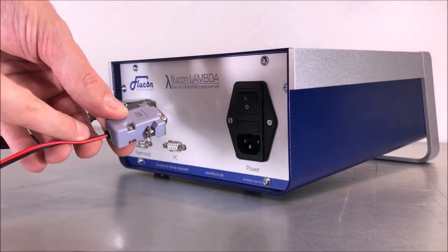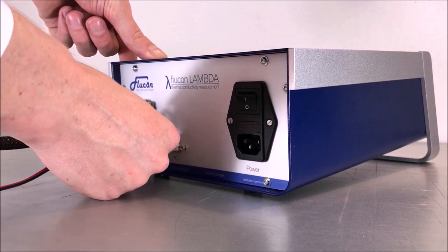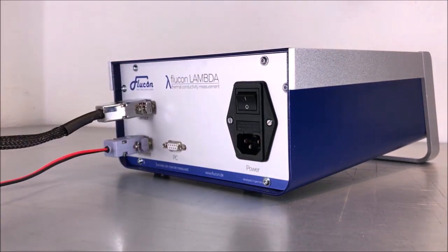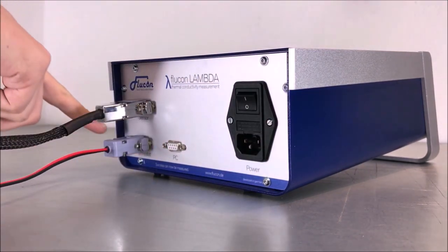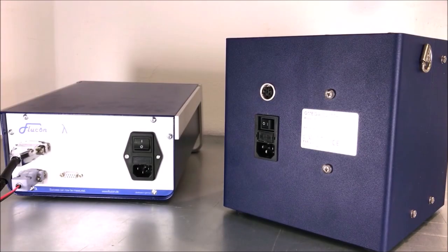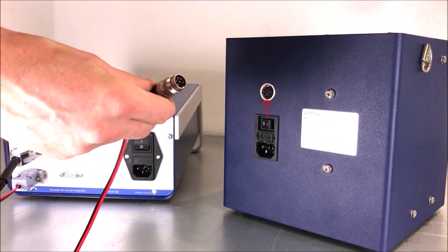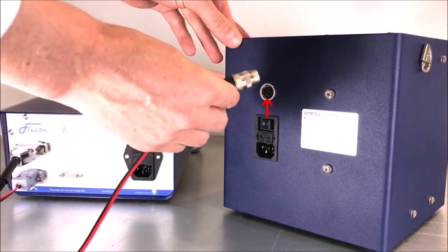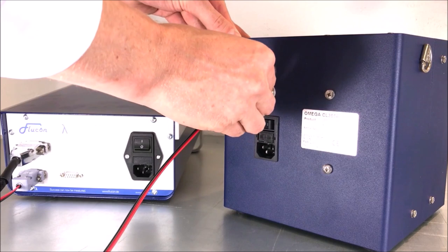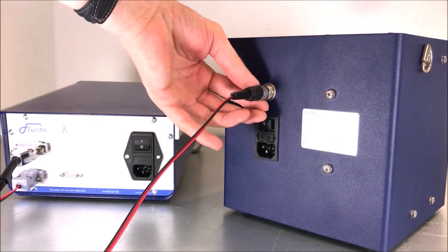After this, connect the sub-D ending of the thermostat cable to the thermostat socket. Again, use the screws on both sides to fix the connection. The other ending of this cable should be plugged into the thermostat with the tiny metal pin facing downwards. Use the cap screw to tighten this connection as well.